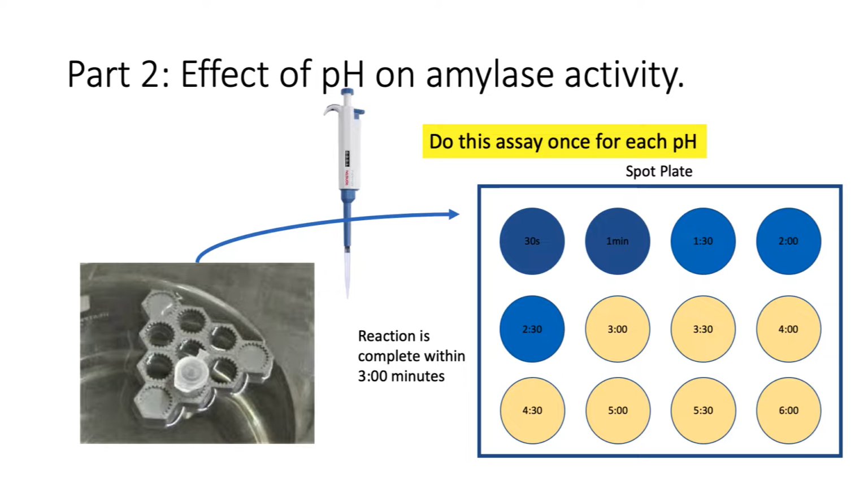So in this case, after we started the reaction, after all of the ingredients were in, we took some out and put it in this spot here. Okay, that's our 30-second marker. Okay, then we left this in the warm water, and after 60 seconds, or 30 more seconds, we took some out and put it here. Now, since this reaction is only starting, we expect there to be still some starch remaining, and so the starch will react with the iodine to form this purple blue-black color.